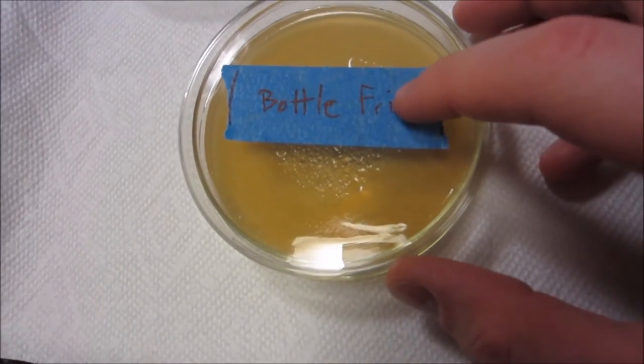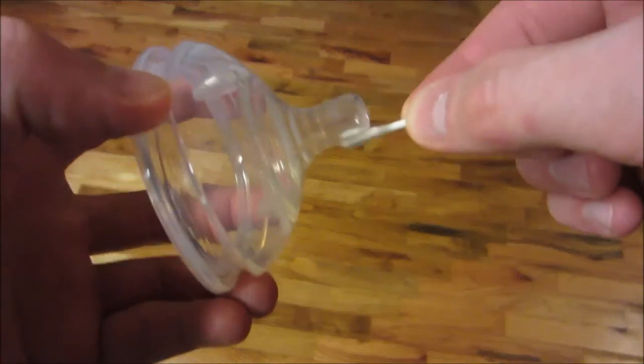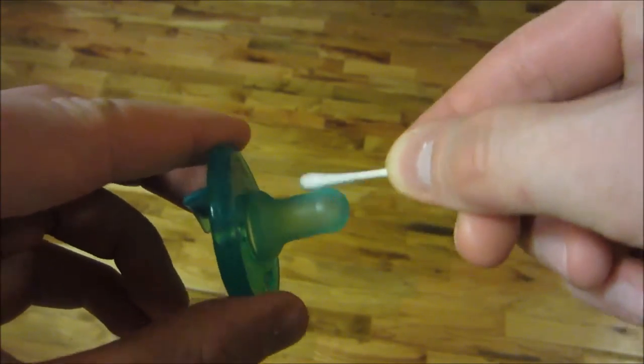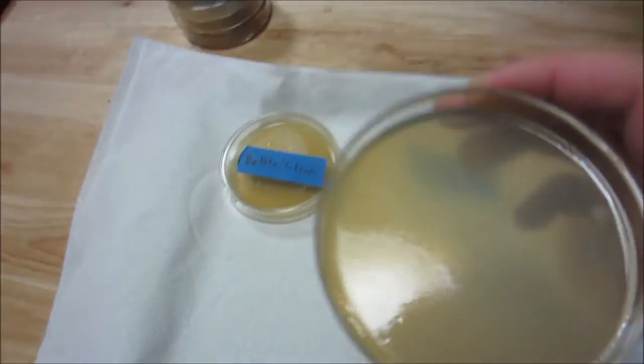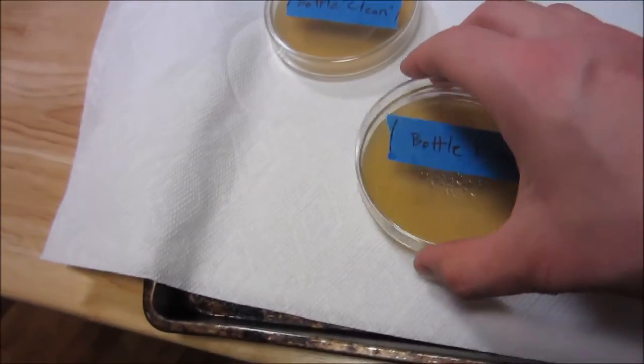Next, we have a rinsed bottle nipple. Surprisingly, the rinsed has about as much growth as the soap and water washed pacifier. I can only conclude that this has to do with the texture of the silicone itself. Both are medical grade silicone, so the frosted texture of the pacifier must be responsible for holding those extra microbes, whereas the very smooth silicone texture on the bottle nipple doesn't allow microbes to stick easily.